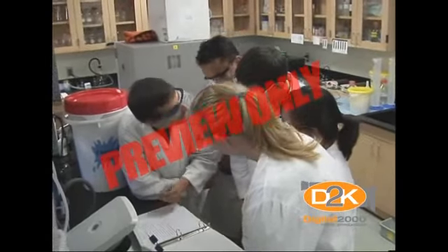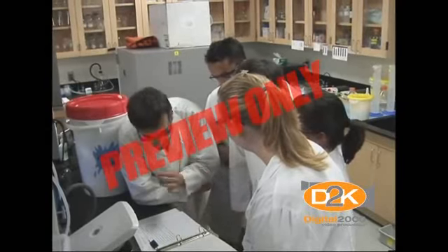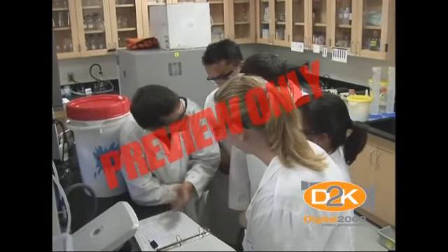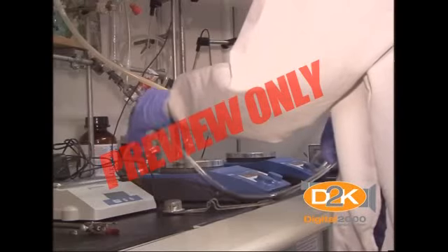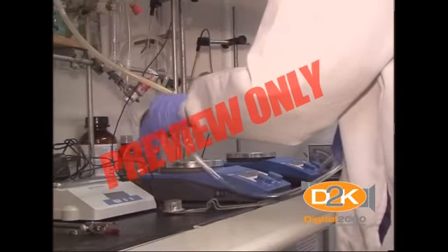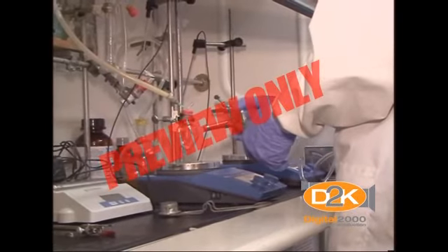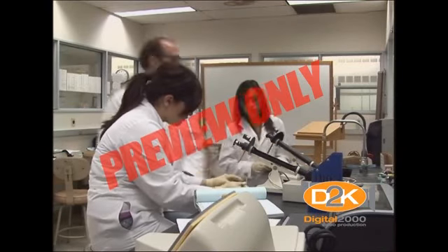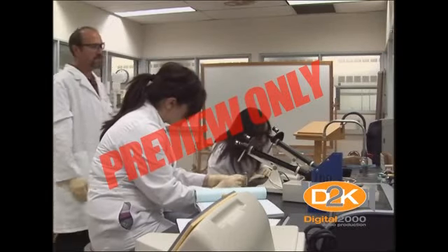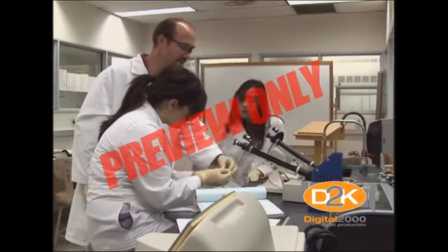Professors, principal investigators, must prepare standard operating procedures, SOPs, for every experimental procedure that involves hazardous agents. The SOP shall define the hazardous operations, designate safe practices, and select protective equipment. Your professor, principal investigator, shall then make sure that laboratory workers receive instructions and training in the SOP to ensure safe work practices in the laboratory.